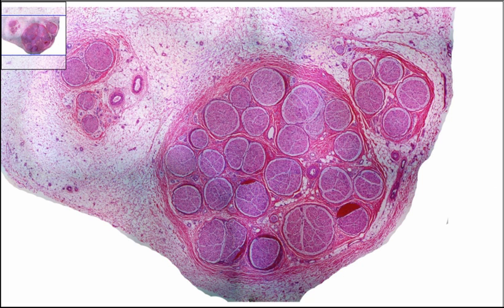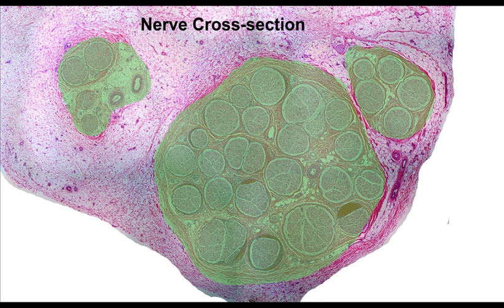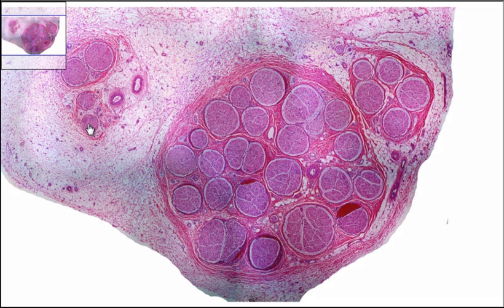This slide is a cross-section of a nerve. What you're seeing is you have one bundle of a nerve here, a second bundle of a nerve here, and a third one over here. This slide's magnification is about 10x total magnification. The reason I'm saying about is because this slide is actually a composite of several images taken at 40x and then put together.